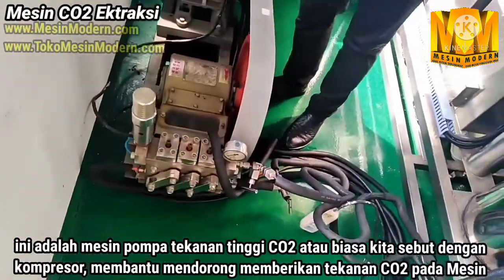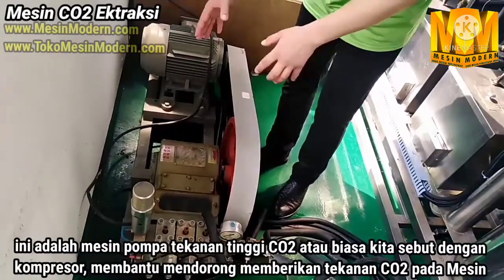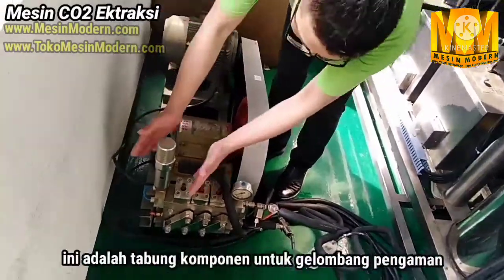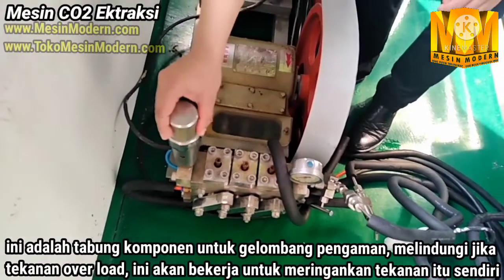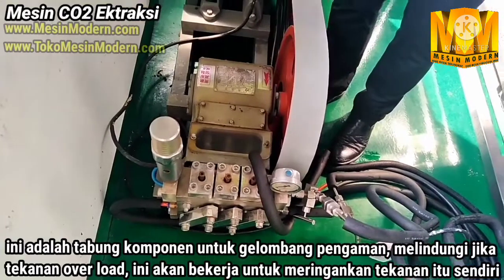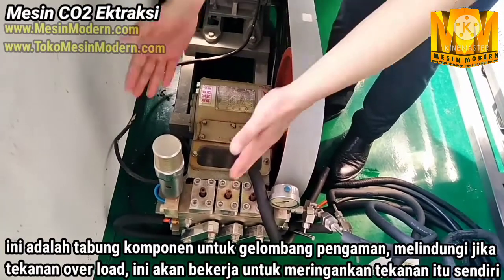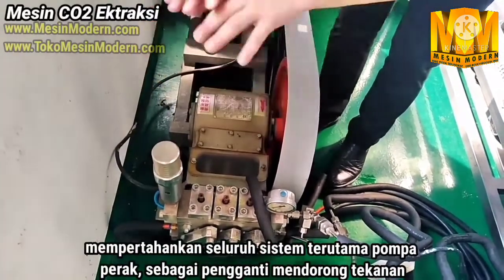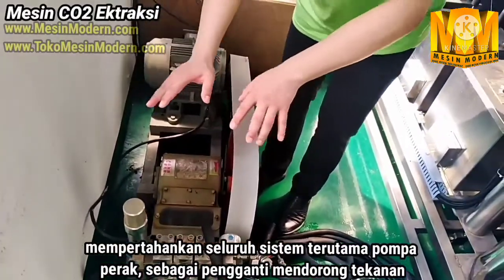This is another main part — it's a CO2 high-pressure pump to provide the high-pressure CO2 for the main body. And here is a key component: it's a safety valve for safety protection. If the running pressure exceeds the upper limit, this will work — it will relieve the pressure itself, to keep the whole system, especially the CO2 pump, safe.